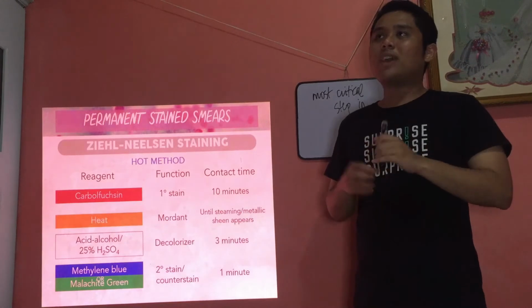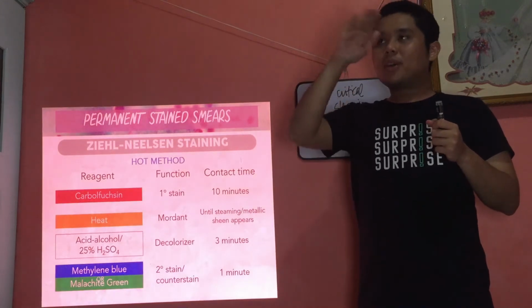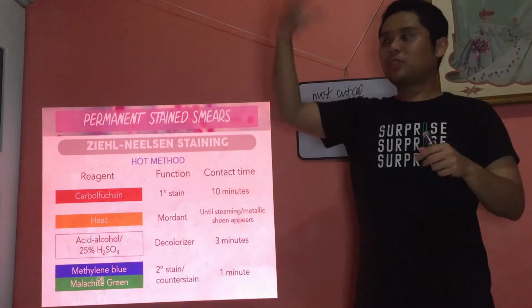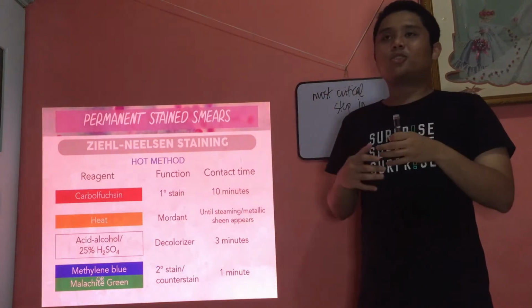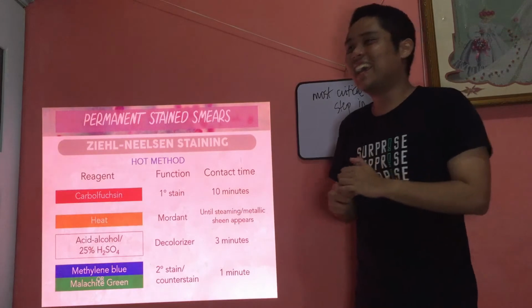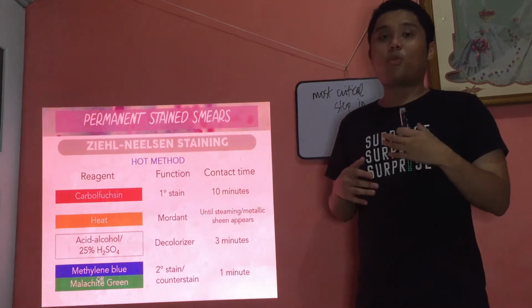The mordant will, in a way, open up the cell wall of the Mycobacterium, because Mycobacterium, di ba, has long-chain fatty acids. So, the cell wall is quite waxy. Maraming fats, medyo waxy. So, pag butang sa carbofuchsin, or when you add carbofuchsin, it will not penetrate that much, because again, it's waxy, it's very thick. So, to open it up, medyo mas mo-open up siya. Okay? Alright, we then apply heat para mas musulod ang carbofuchsin. Okay? Alright, that's the purpose of the heat.